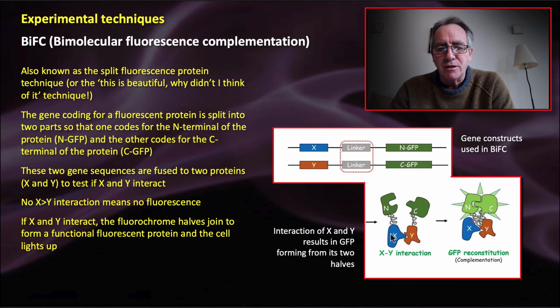If X and Y interact, they come right together. That brings the N and the C terminals of GFP together, and they fluoresce. Now that's cool. That's an absolutely brilliant way to conclusively demonstrate that X and Y are interacting with each other.